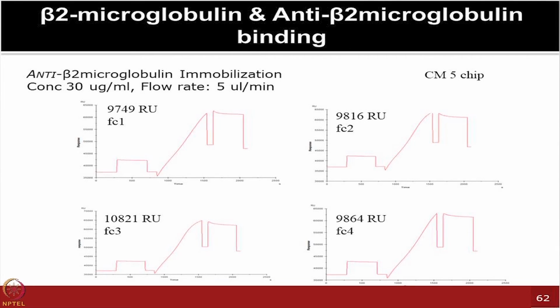with a beta-2-microglobulin experiment, and then used all the 4 flow cells, because you need a lot of analyte to bind, which you can recover and then use for the mass spec testing. So all the 4 flow cells were immobilized, and now when you are passing your beta-microglobulin protein, you are enriching them, and we actually used a pretty high concentration, 30 microgram per ml. Flow rate used was 5 microliter per minute. All the 4 flow cells were employed.